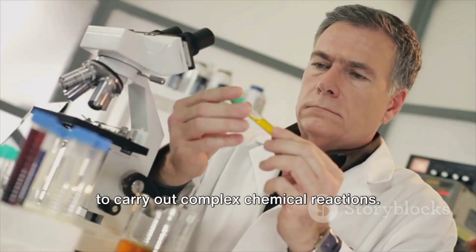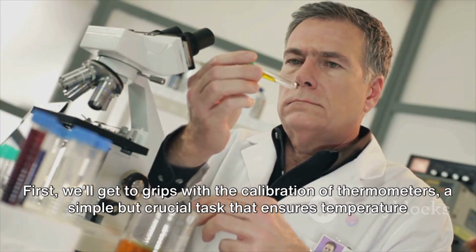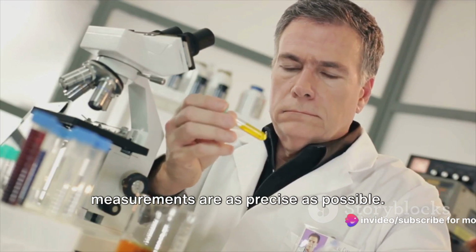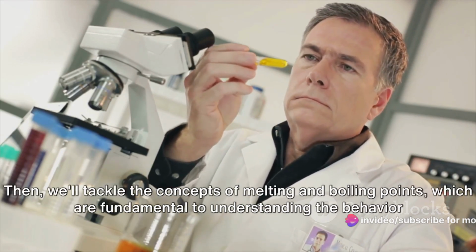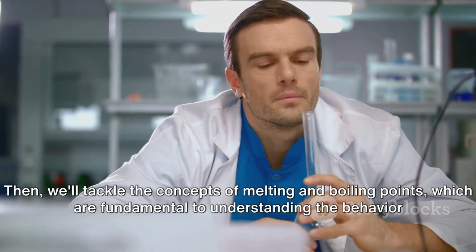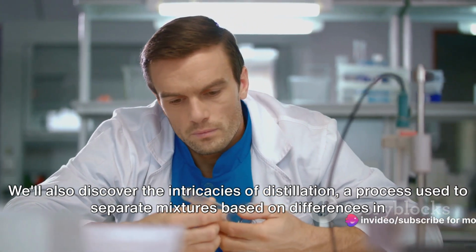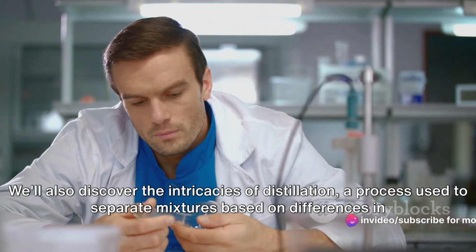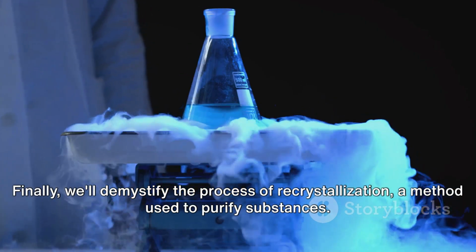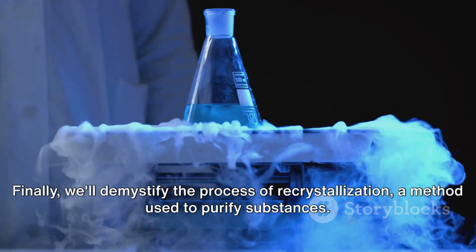complex chemical reactions. First, we'll get to grips with the calibration of thermometers, a simple but crucial task that ensures temperature measurements are as precise as possible. Then, we'll tackle the concepts of melting and boiling points, which are fundamental to understanding the behavior of different substances. We'll also discover the intricacies of distillation, a process used to separate mixtures based on differences in their volatilities. Finally, we'll demystify the process of recrystallization, a method used to purify substances.